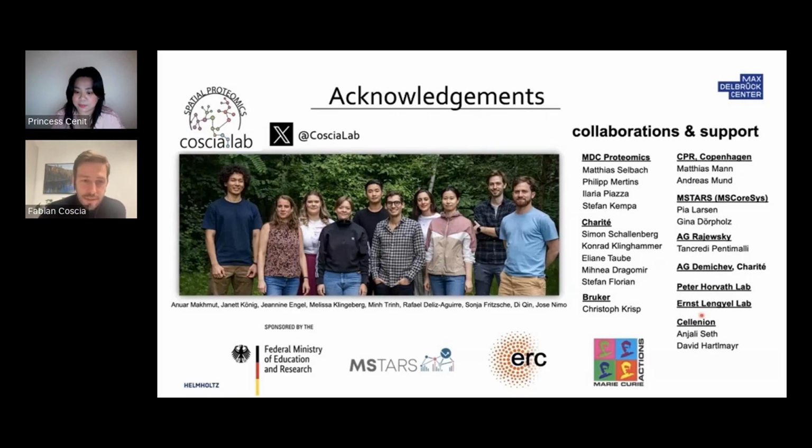Yeah, absolutely. Of course, there are two different ways of doing spatial proteomics. With imaging-based approaches, you have to pre-select which protein you want to look at. If you do an imaging experiment, you have an antibody that recognizes a specific protein in the tissue, and then you would look at this specific protein. So you have knowledge beforehand, before you start the experiment. But this is exactly the beauty of combining these imaging approaches with a mass spectrometry-based approach. This is an untargeted, unbiased approach where we can actually find new biology, new proteins that we really haven't been thinking of, so that we couldn't have known beforehand.